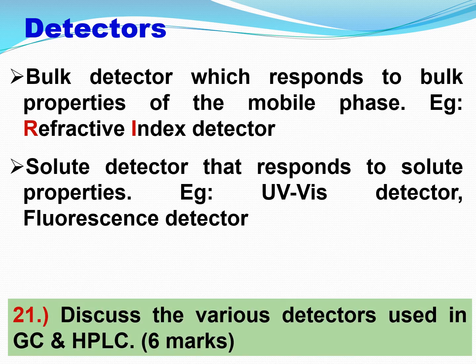Discuss the various detectors used in GC and HPLC. That is a 6-mark question asked in a university exam.